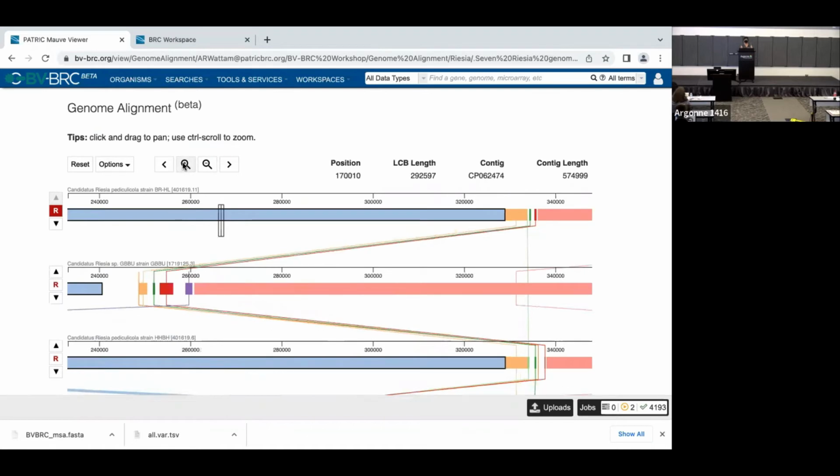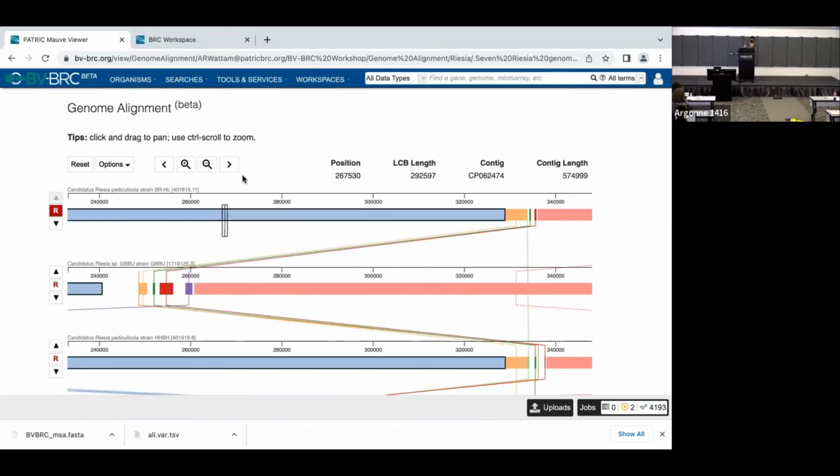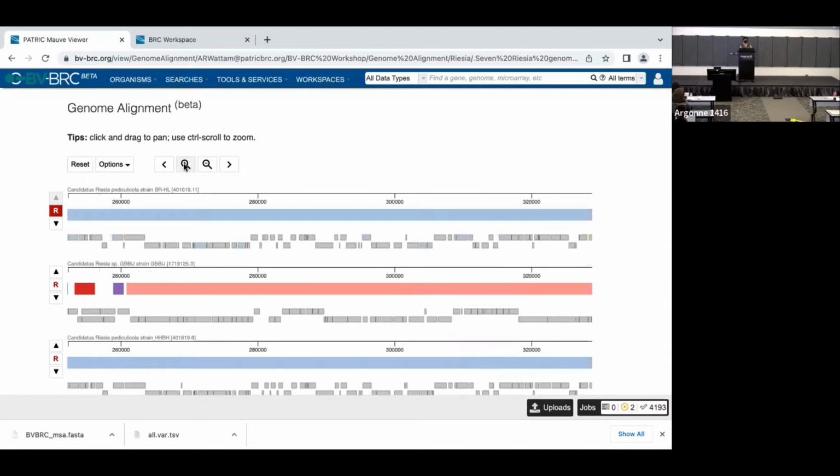And sometimes when you zoom in, you can see that other colors pop up. This is something that's in the gorilla genome that was not in the human one that was used. So if we keep on going in and in, then you can also get a sense of the genes that are in that particular area. So look, this is a tRNA synthetase gene, and you can just mouse over those and see what they are.